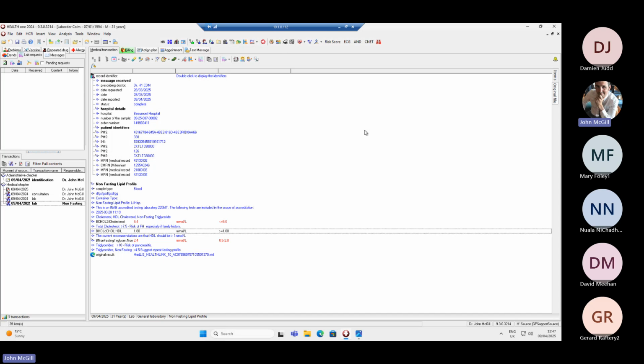Now, so basically that there is really all I have, unless anyone has anything else they want to add in there. Just one thing in terms of the collection date and time, the request would be that it would be done real time or as close to real time as possible, because you can't re-edit. Once an order is submitted, you can't change anything on the order that's gone in. So the collection date and time has to be done at the time that the patient is in front of you and the request is being placed, for safety issues or for processing requirements within the laboratory.